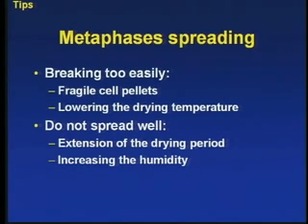The other case is that immediately after you drop, you look under the microscope a few minutes later, and you don't have chromosomes spread out. They are just all stuck together as one big black ball. So what are you going to do? What you can do is extend the drying period. If you want to play with the solutions, you can reduce the alcohol content of your fixative. So you can resuspend your cells pellet into a different kind of fixative. Or you can increase the humidity of the room, which you couldn't do that well. So what you can do is put the slide into a humidified box to do that.